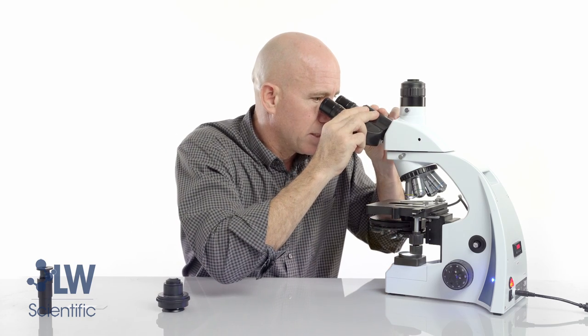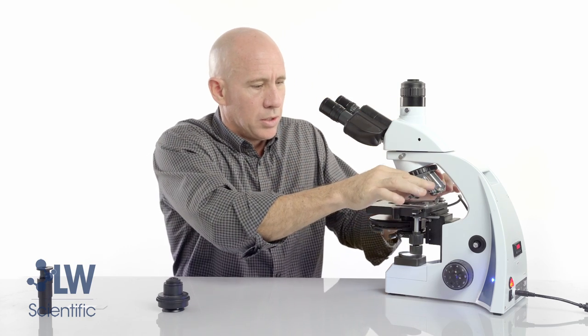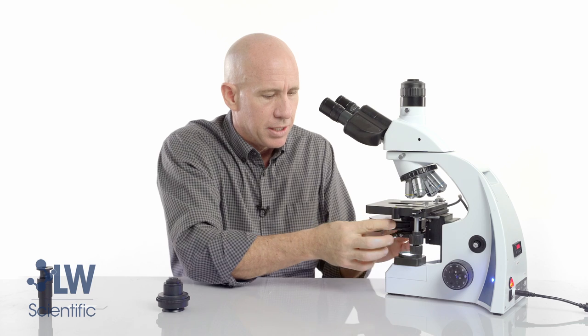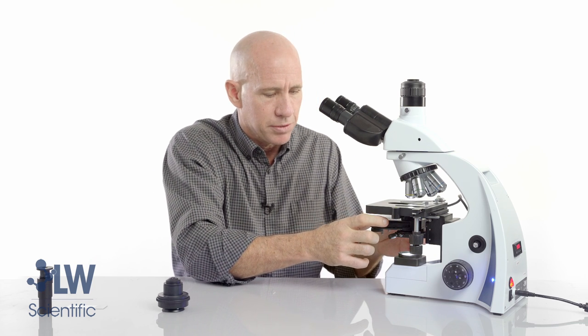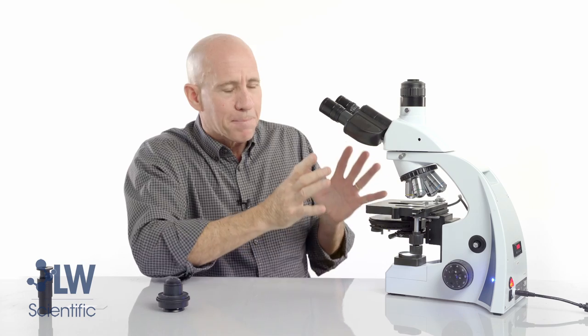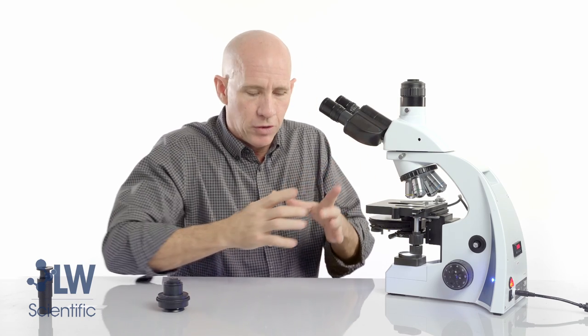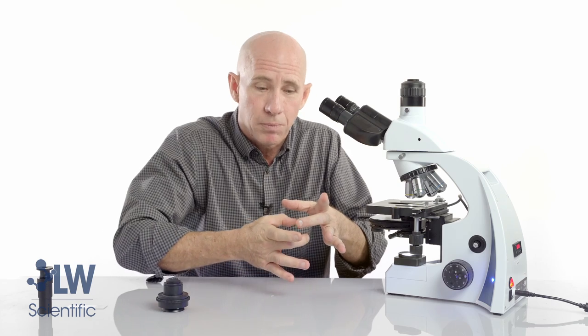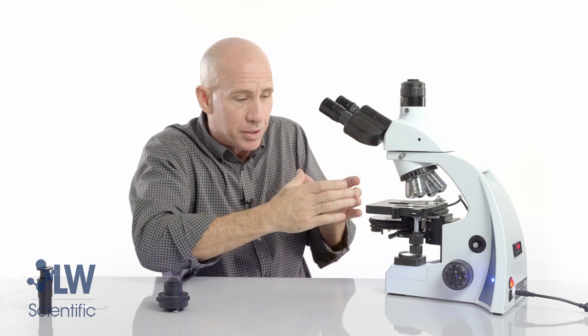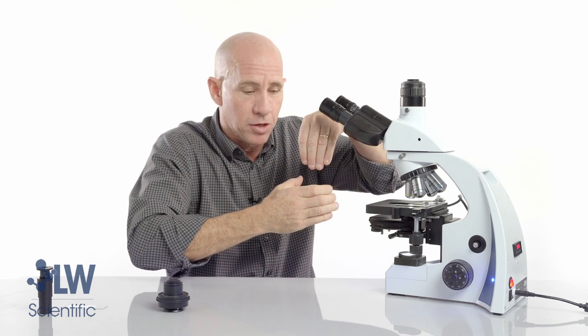Now I'm ready to use the microscope in phase contrast. Remember, there is also a bright field setting you may use for regular cytology work, with the iris control. If you had a hard time lining your rings up — if the dark donut and the light ring did not really align and it was too far in one direction — you may have a gross misalignment of the condenser, meaning the condenser itself is not fully centered underneath the objective.